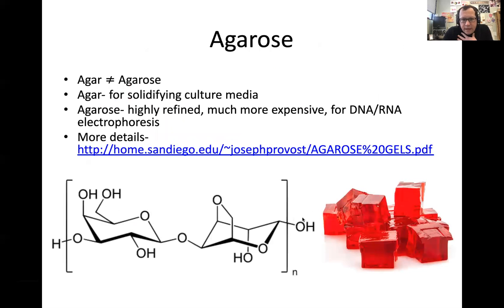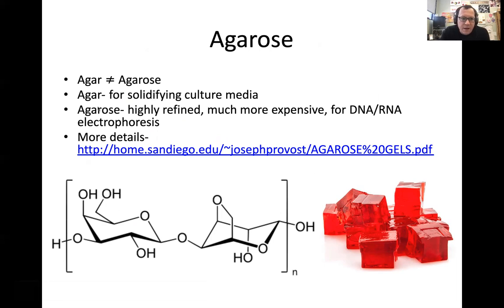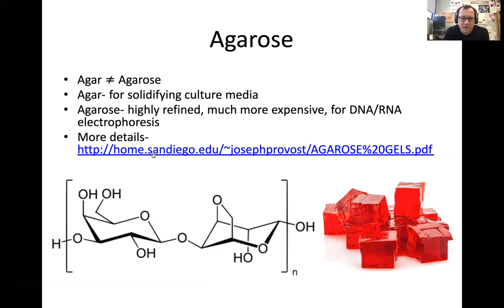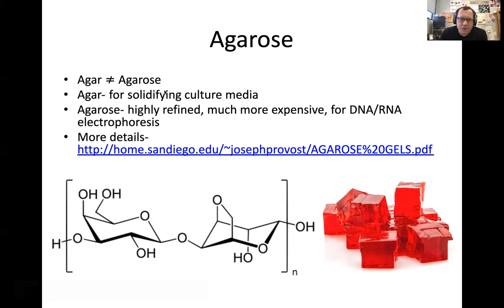So how do we look at DNA? Well, we use a molecule called agarose. It's basically a sugar structure, long sugar chains. It's kind of a derivative of something called agar. Agar is a seaweed sugar chain polysaccharide. There's some more information here, but basically agar is a not super refined seaweed derivative. Agarose is very much more pure and allows for DNA separation.